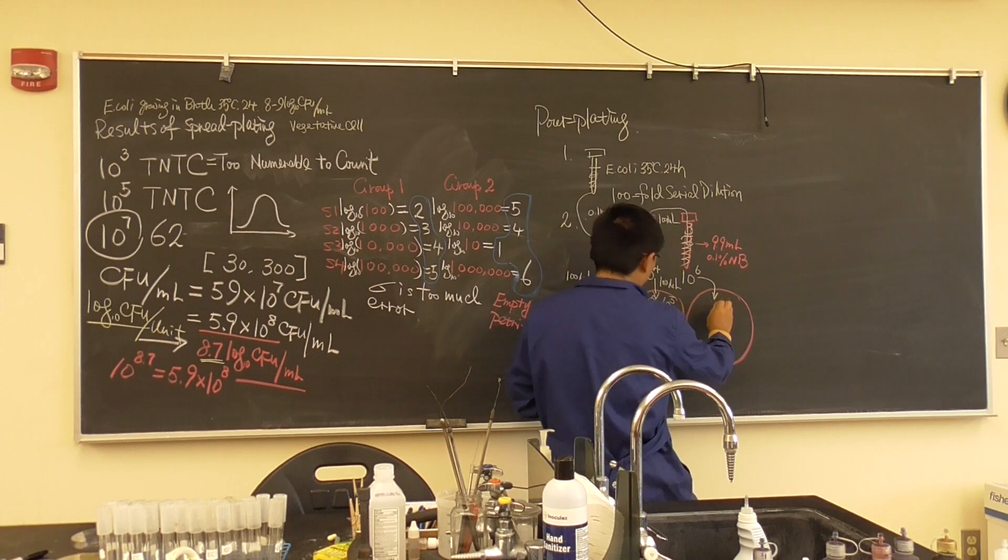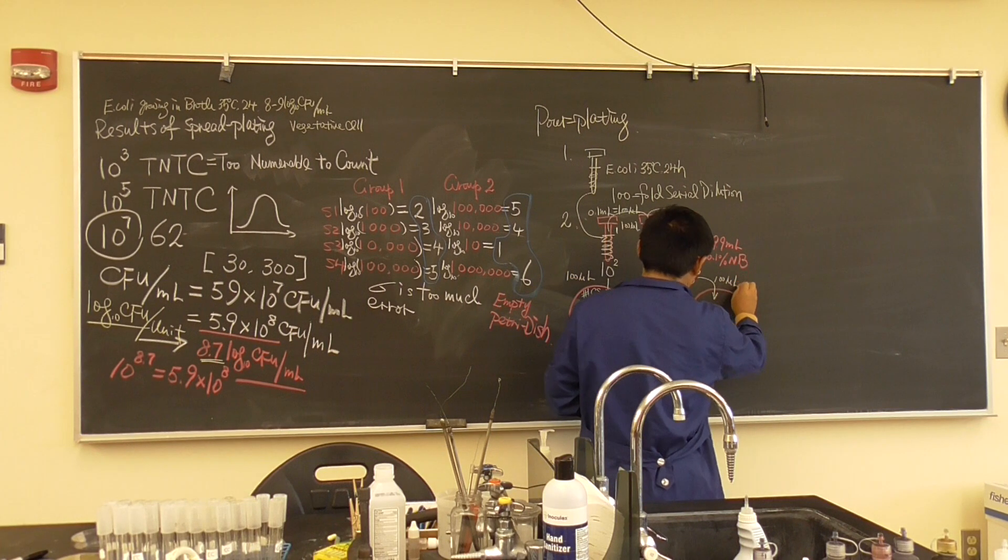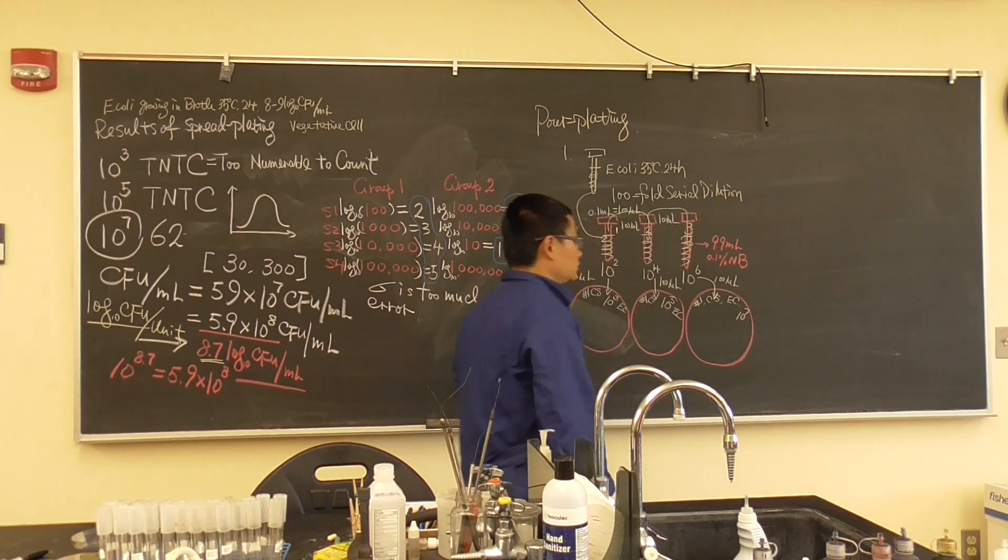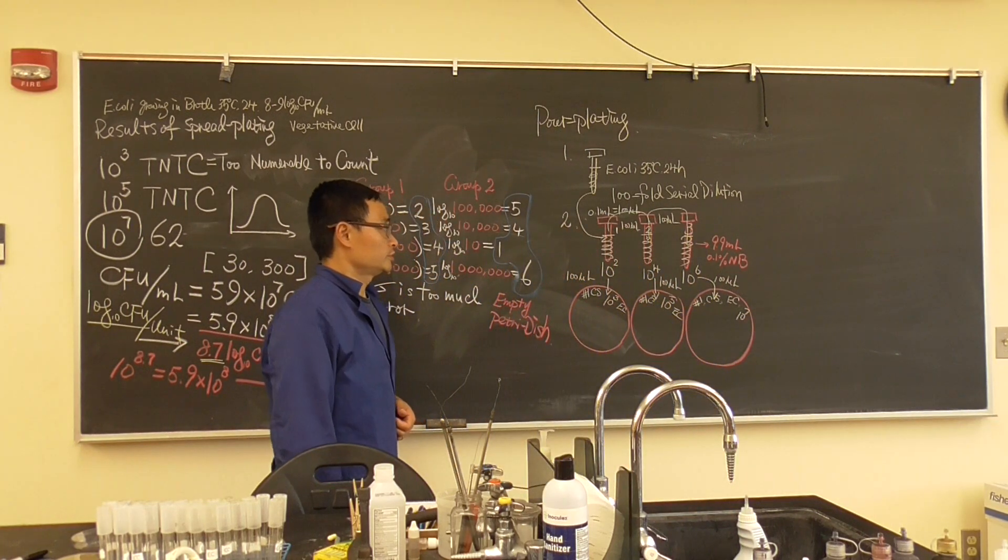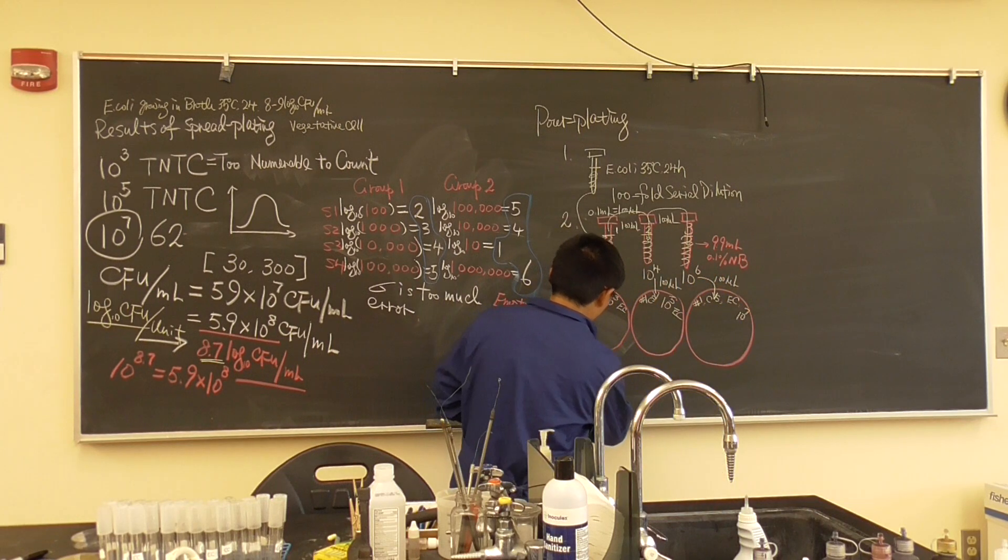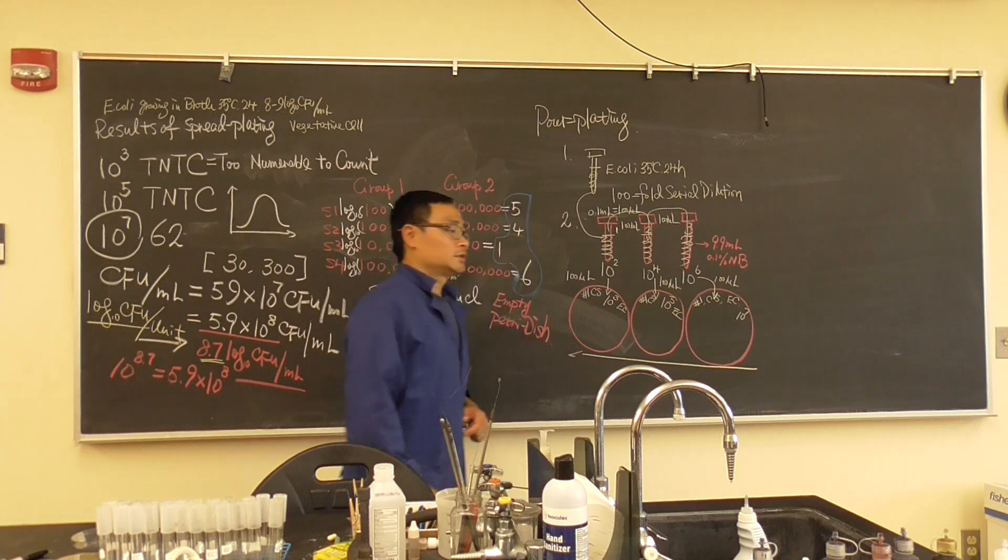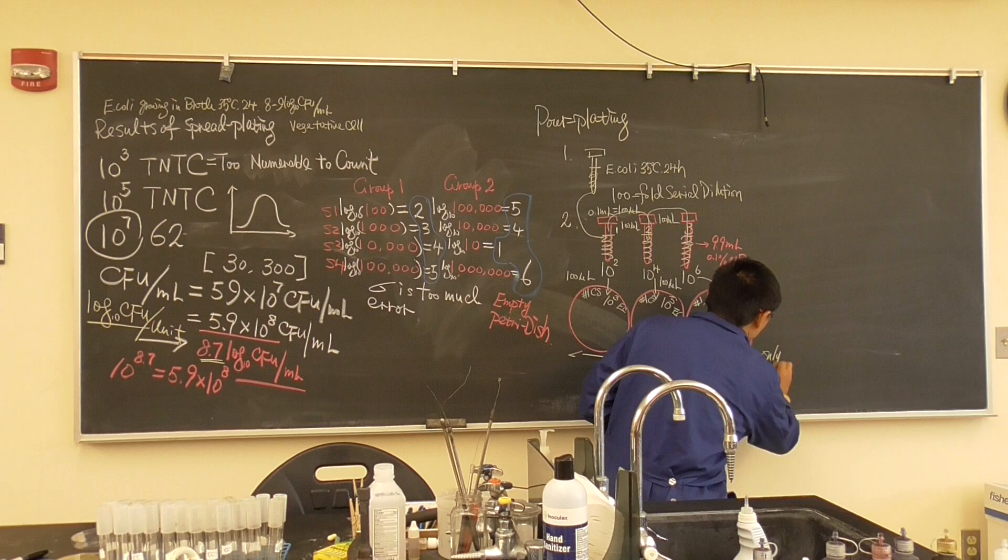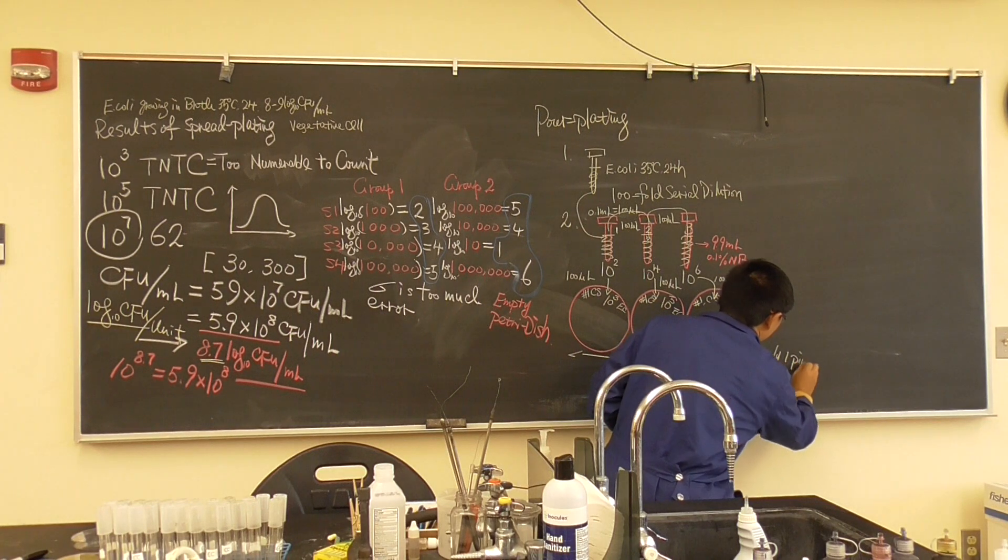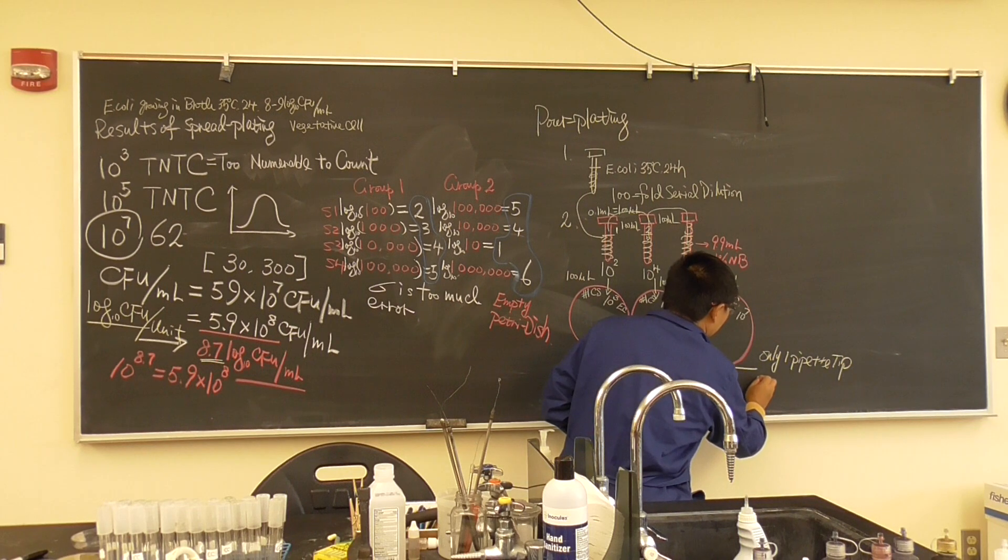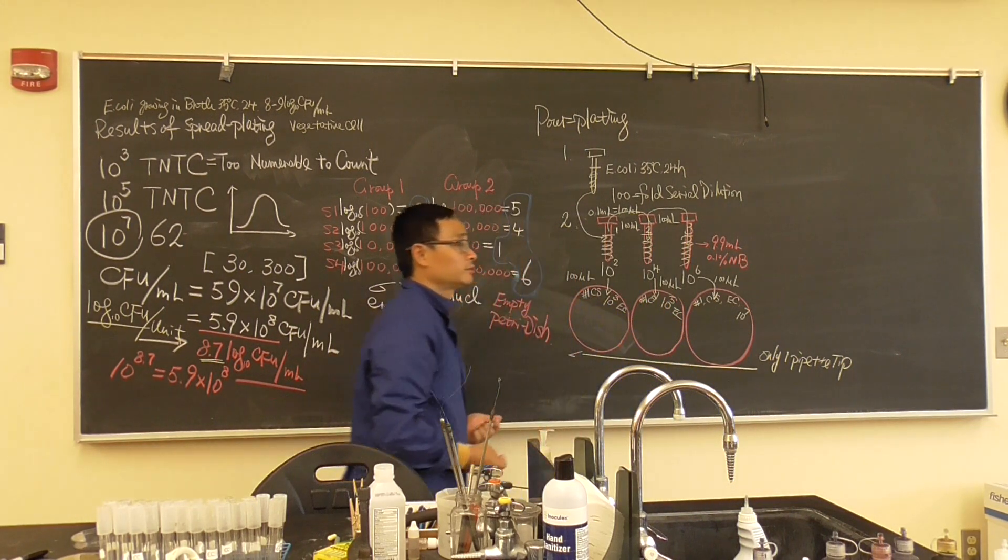Now the last one goes here, 100 microliters. Bench number, initial bacteria name, and the concentration. Oh sorry, the dilution. Same thing, from highest to lowest dilution, only one pipette tip, and yeah, only one pipette tip you added it.